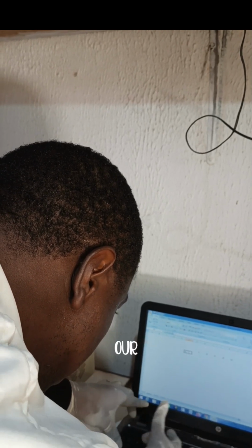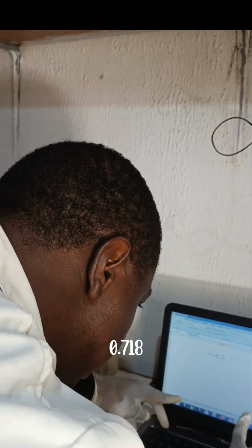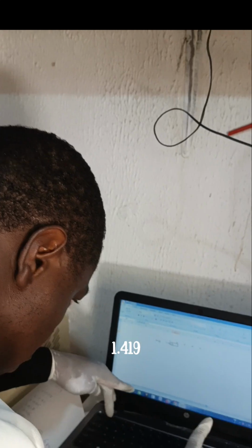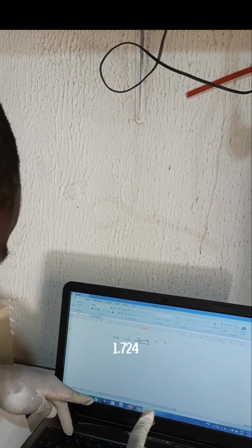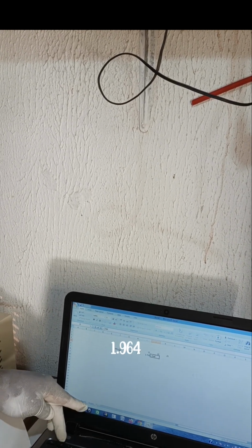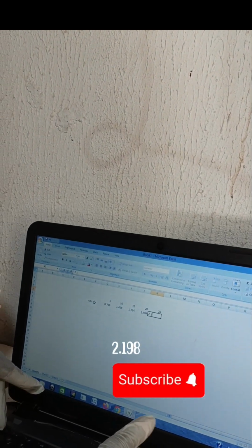And we'll have our absorbance 0.718, then 1.419, then 1.724, and 1.964, then lastly 2.198.